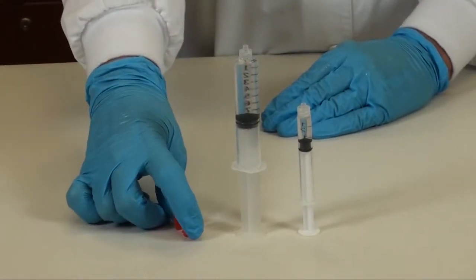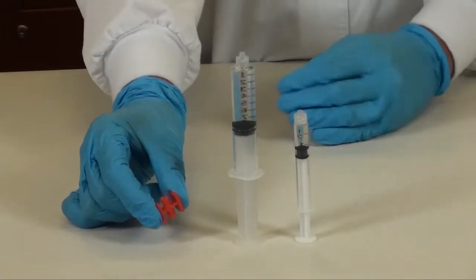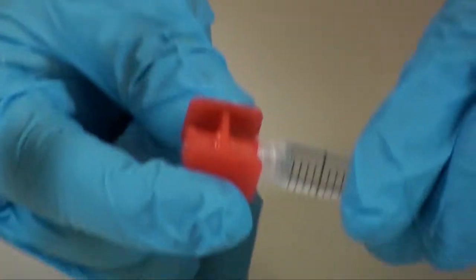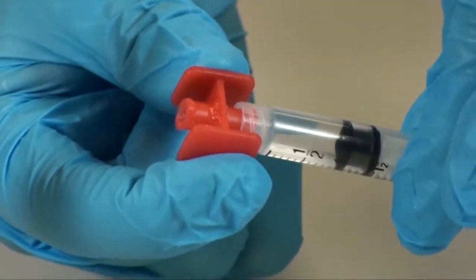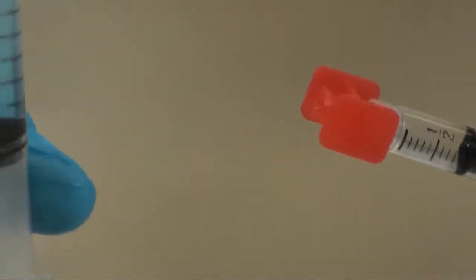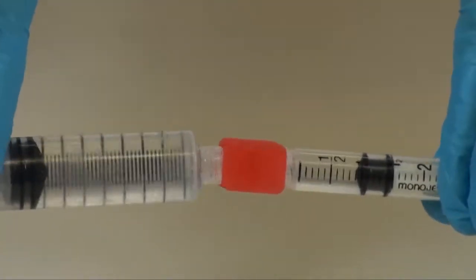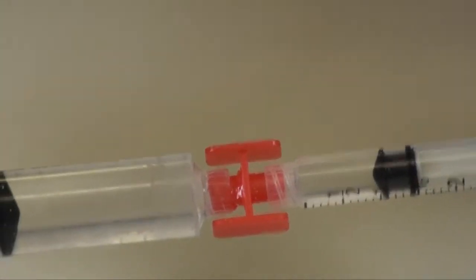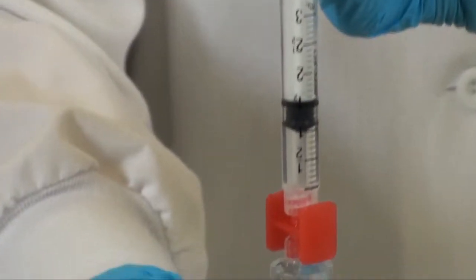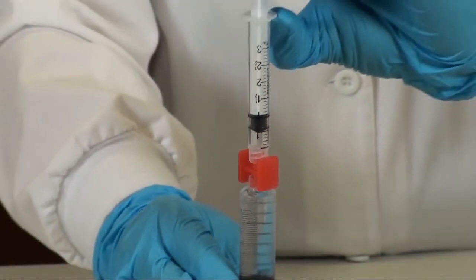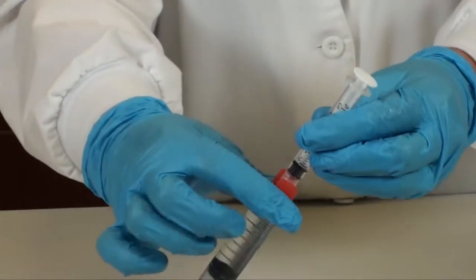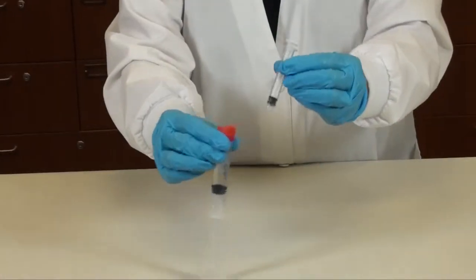So you do this by using a syringe connector. We will attach it to the 3ml syringe and then attach our 12ml and luer lock that on. And then add the solution into the 12ml syringe. Go ahead and twist off the 3ml syringe.